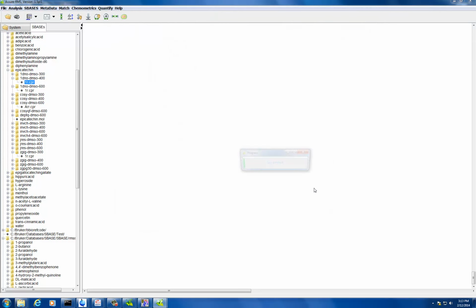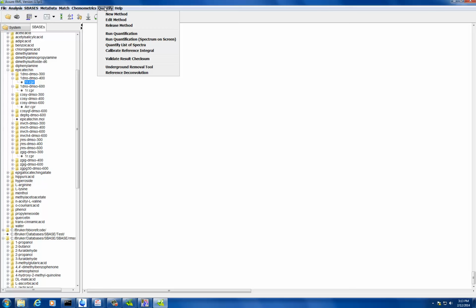Save. How often do you recommend doing a reference calibration? Like every time you do a run, or?